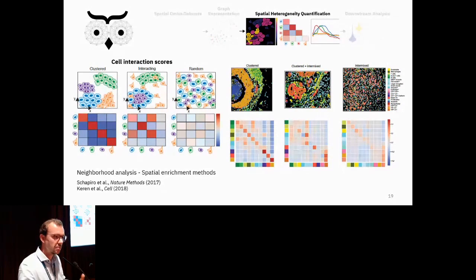But not, I mean, the protein abundance is kind of reflected in the phenotyping that you do, right? You could also just binarize the data and say, okay, all cells that have a protein A level higher than X are positive and the rest is negative, and then compute the interactions between positive and negative cells based on a single protein expression level, more or less.